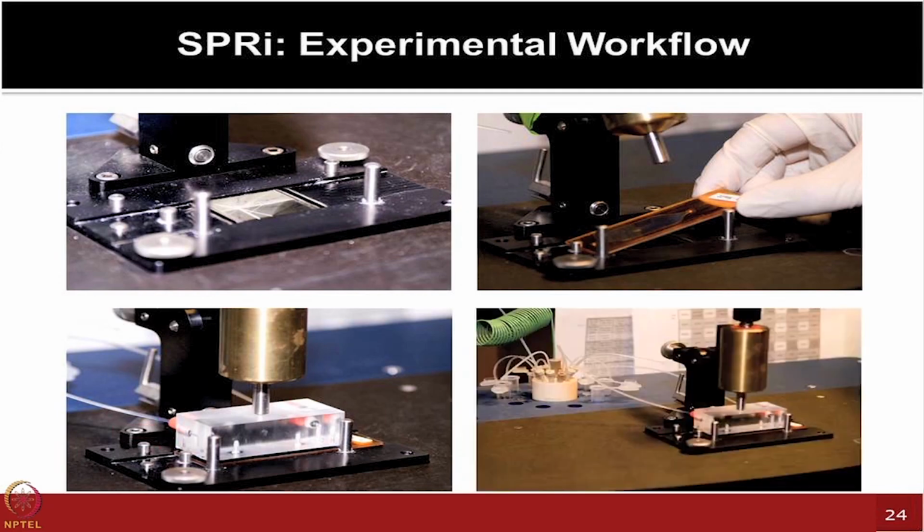And it probably reminds Josh of one of the old setups, the prototypes, where you can test 8 antibodies, for example, or 8 different proteins in a very new format, like you are developing a new instrument setup, and these kinds of solutions are coming in. You have the gold chip, everything is passing over it, and then going back into the washing containers.